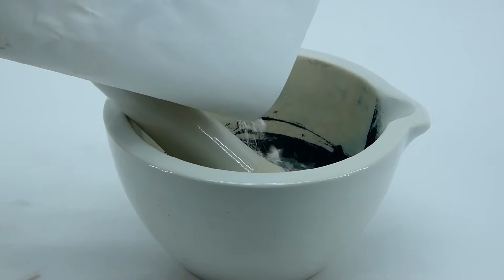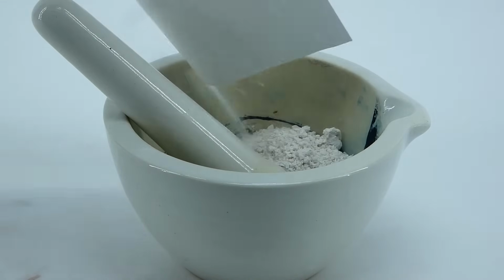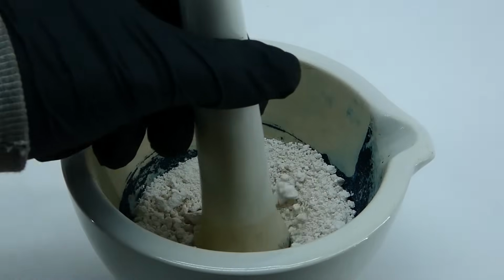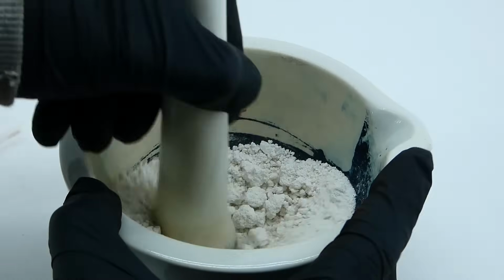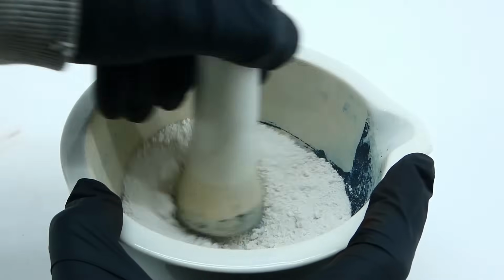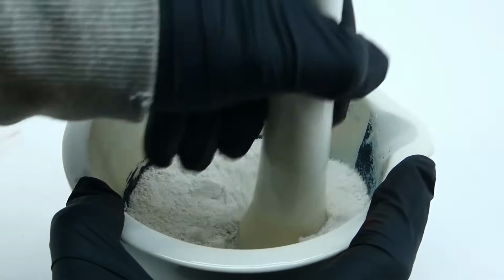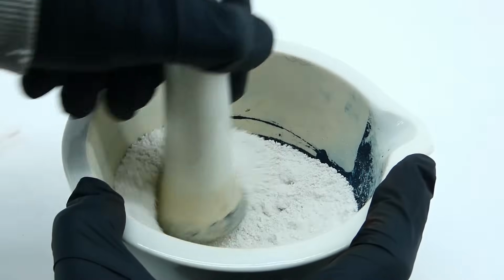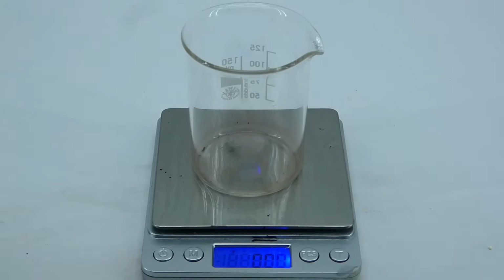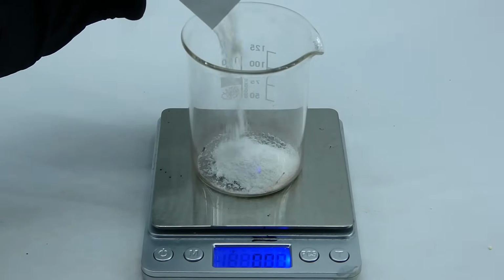The first one is of course my silicon dioxide, but before I can use it, I first need to grind it into a powder, because this reaction only works when the ingredients are finely powdered. I used my mortar, which is stained with a lot of Prussian blue that I still don't know how to clean off, and when the silicon dioxide was a nice powder, I weighed out 18 grams of it on my scale.